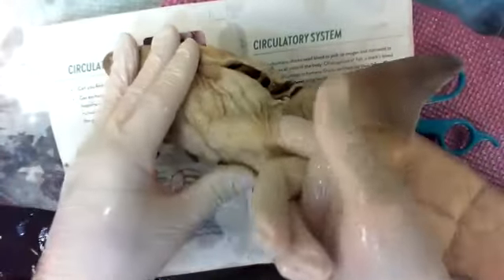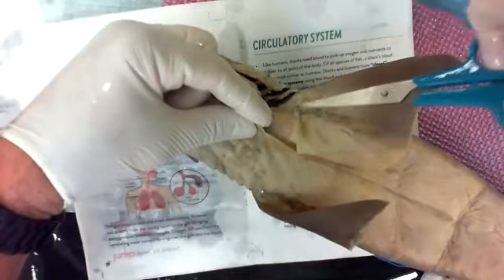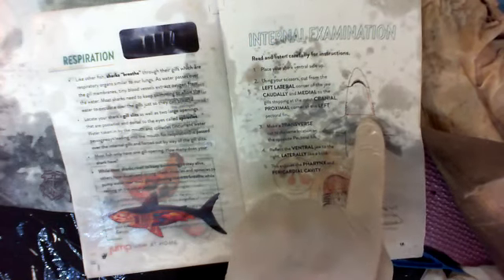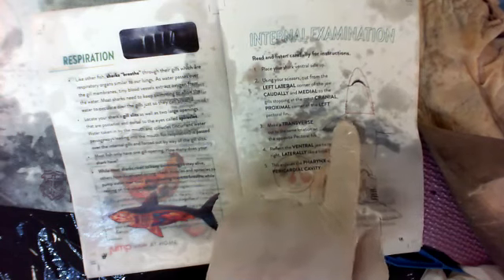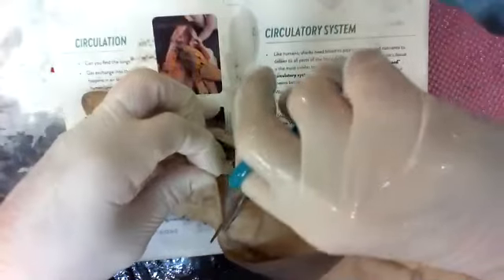Okay, so I've actually dissected way down and way up. And if I wanted to, I can make that cut across like it shows. So it showed cutting from the top of this fin to the top of this fin. When I say show, I meant right here. So it says cut transverse from the proximal cranial corner of the pectoral fin to the proximal cranial corner of the other pectoral fin. That's what I'm going to do. I'm going to cut across. Shoop, shoop, shoop. How easy that cut. Amazing.